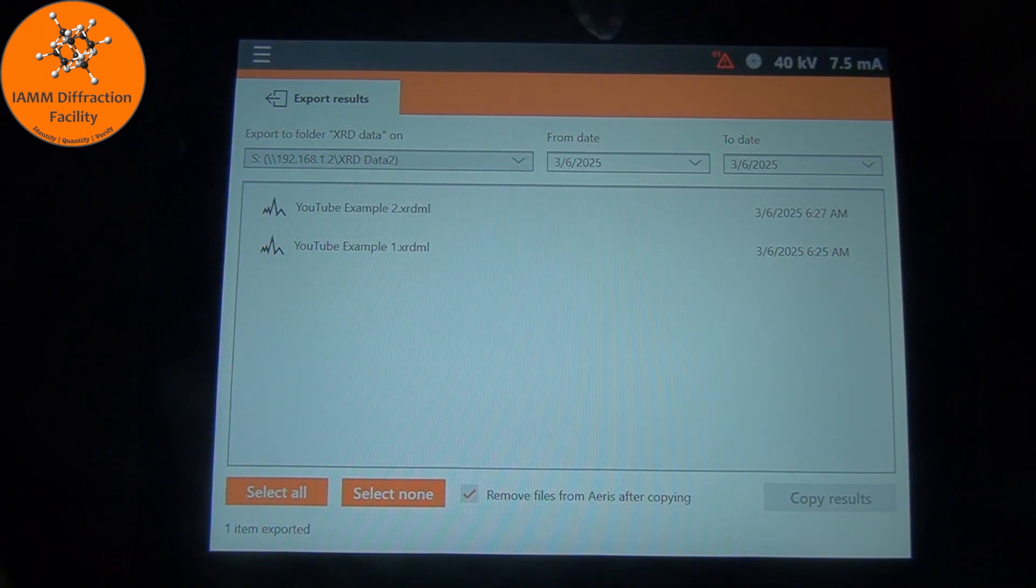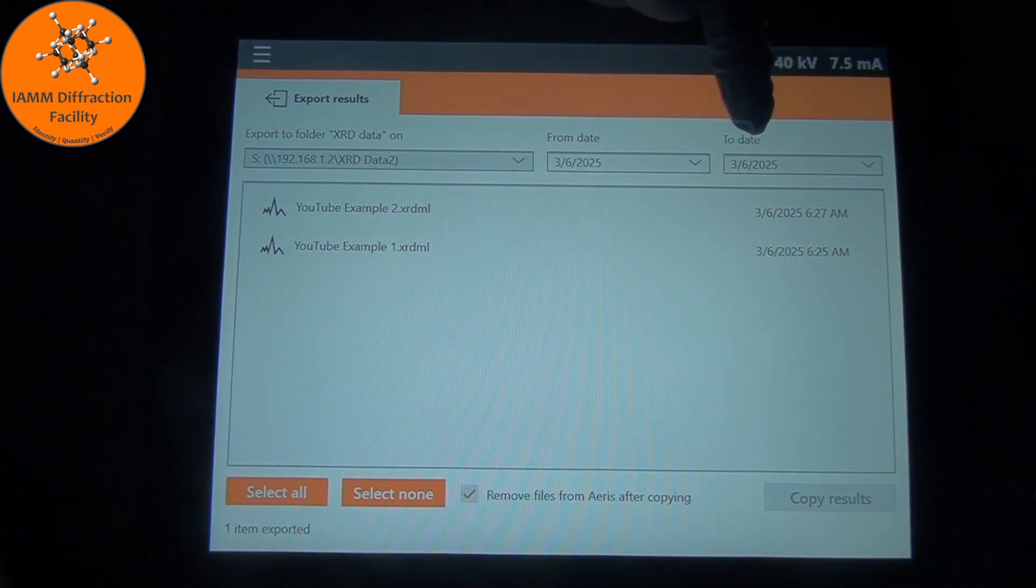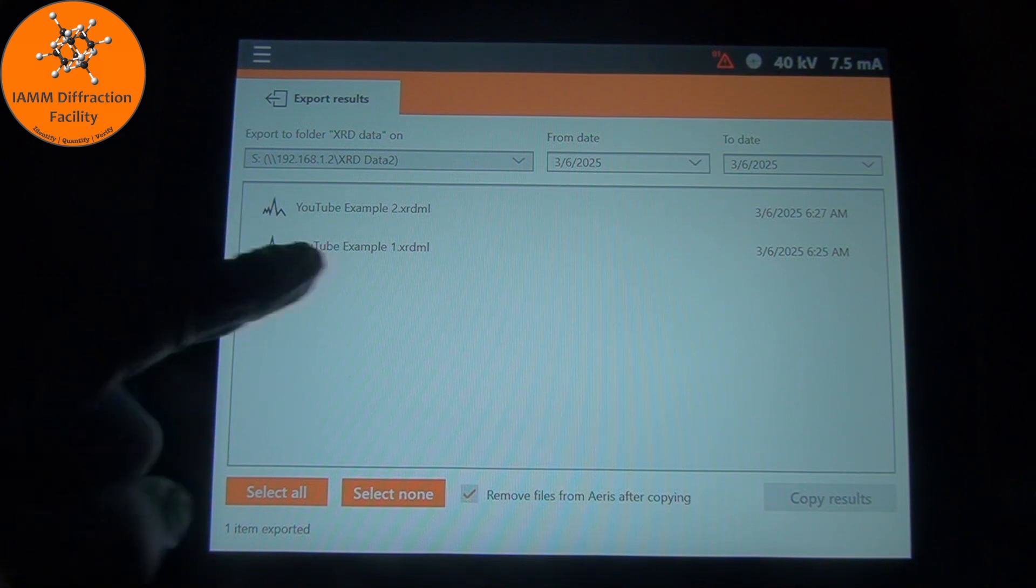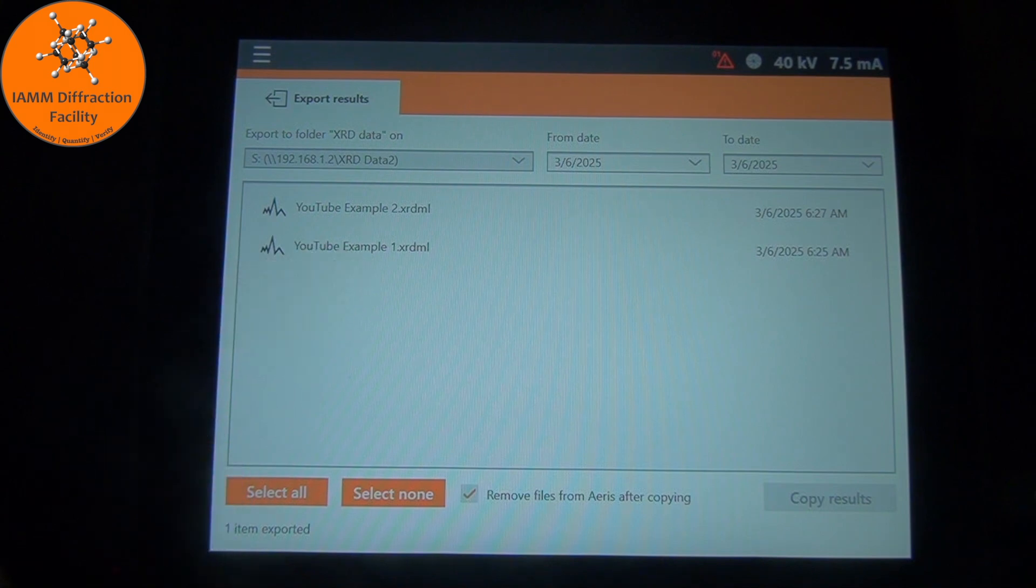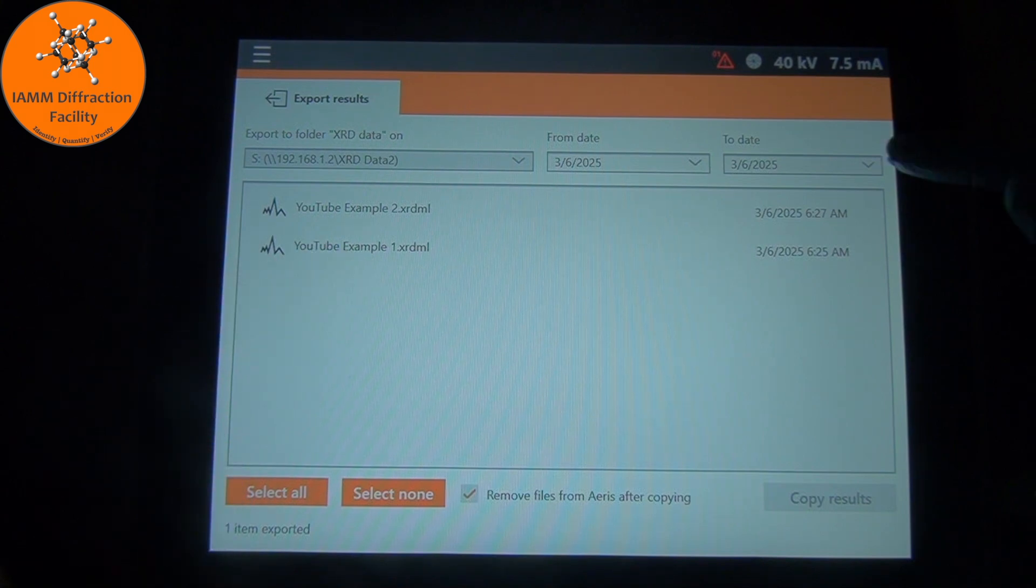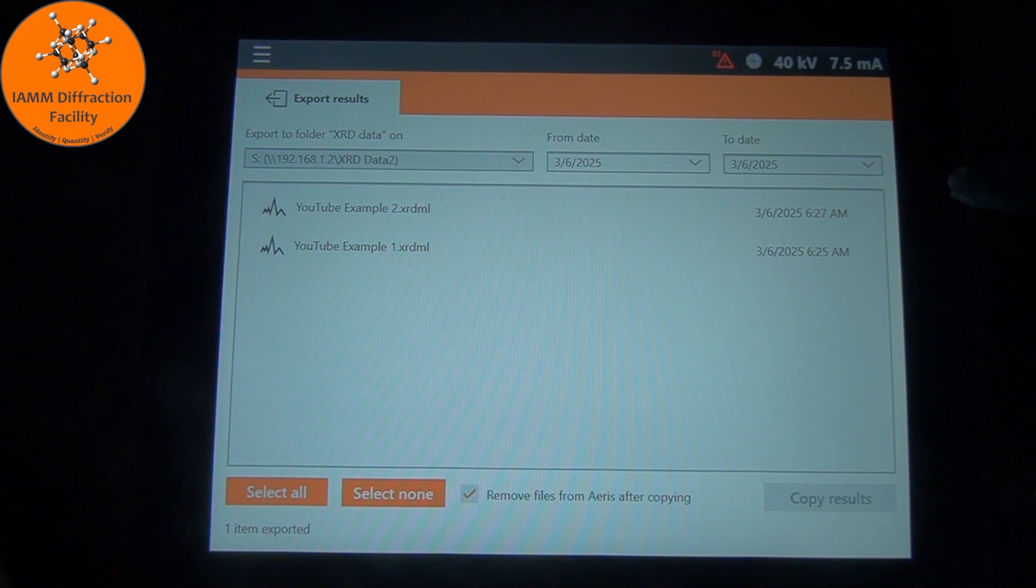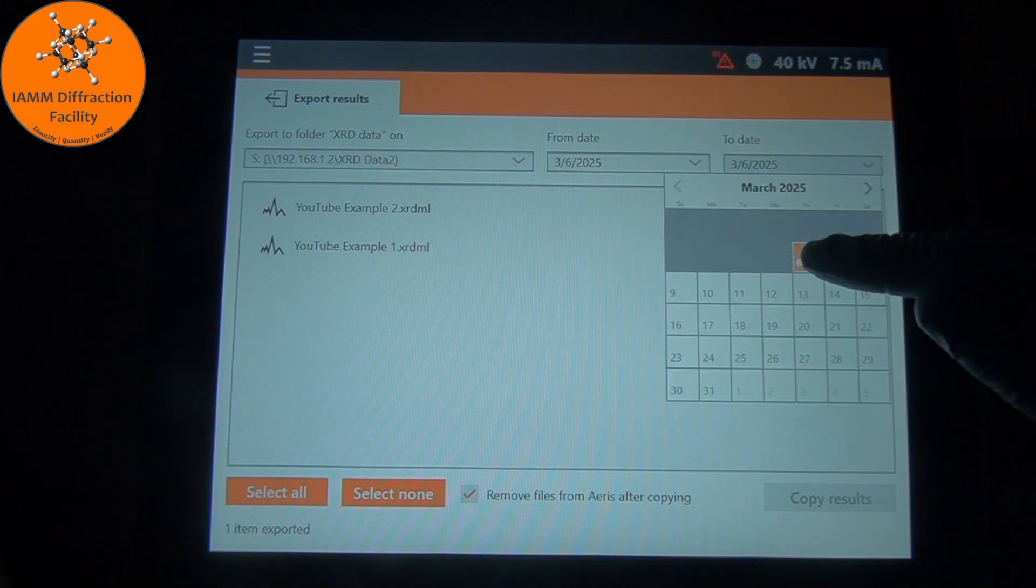We see the folder that it will be sent to on the computer. Here we see the from and to dates. These will determine what files are shown here. If you don't see your data here in this window, it's probably because this to date is incorrect. So you just click on the down button and select the present date.